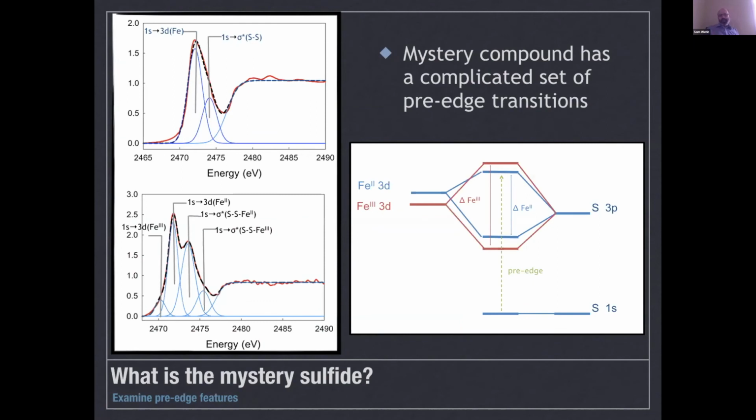One possible interpretation would be to separate this into a series of 4 Gaussians. This could be described by the sulfur seeing both iron 2 in the disulfide and iron 3. Iron 3 has a lower energy level that brings our lower area down, and the crystal field splitting is higher, so that would create, in a hand-waving kind of way, peaks at the lower and upper end.